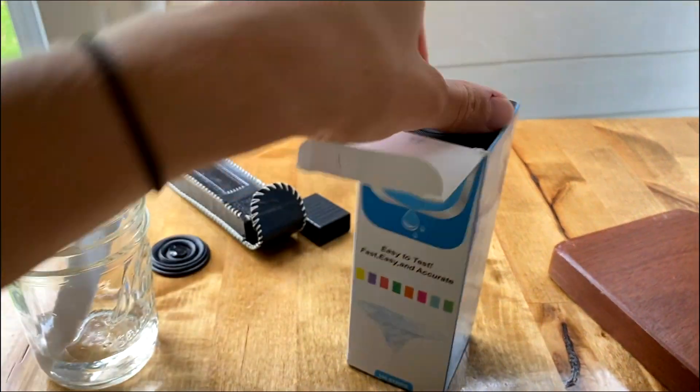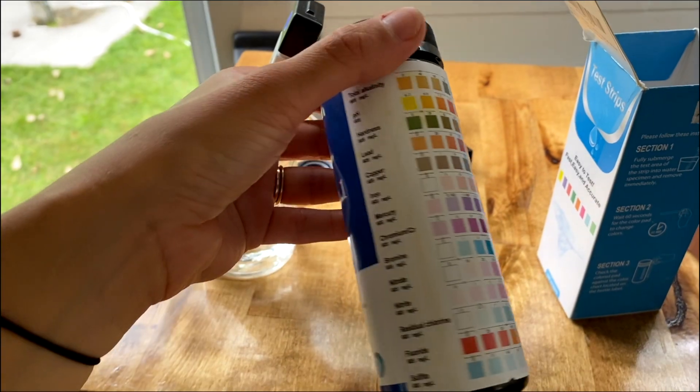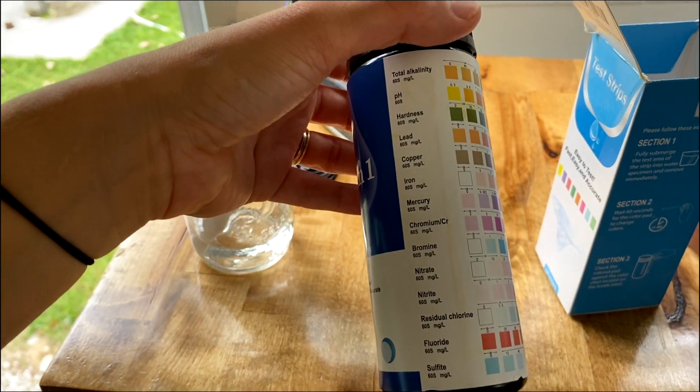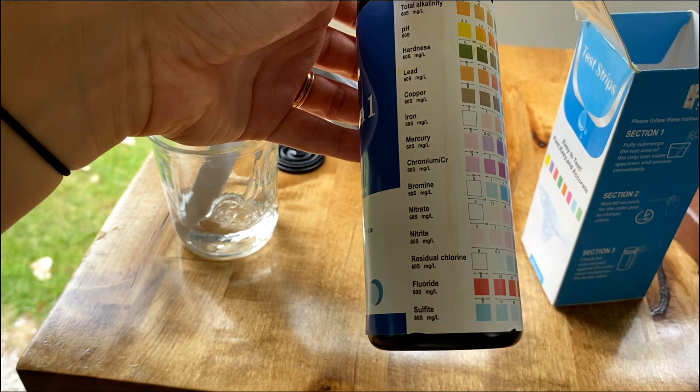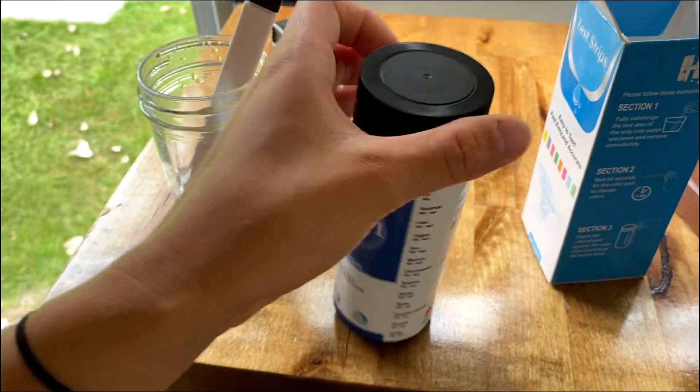So we do have other ways of testing the water. Basically put a strip in and you can see the lead, alkalinity, pH, and kind of get a feel for it.